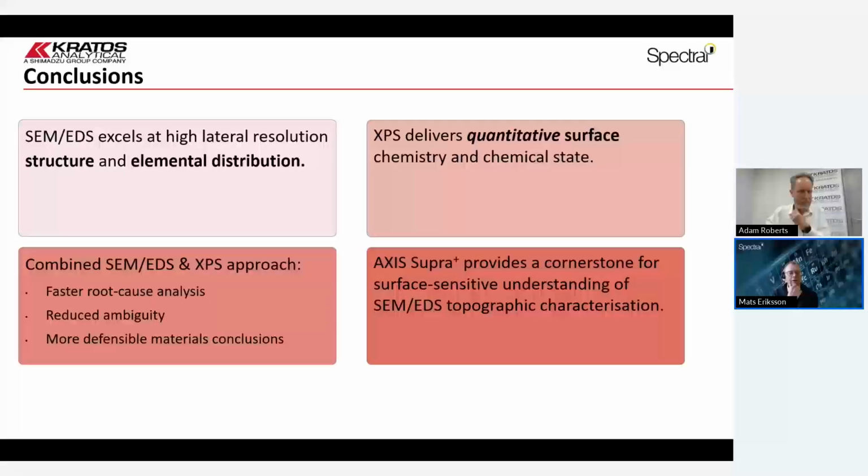The composition varies depending on morphology and varying electrical conductivity to the stage or the sample holder. There are challenges for SEM EDS due to shadowing, and we talked about the detector sitting on the side also in the SEM case. So how would be a useful workflow for analyzing those kind of particles?